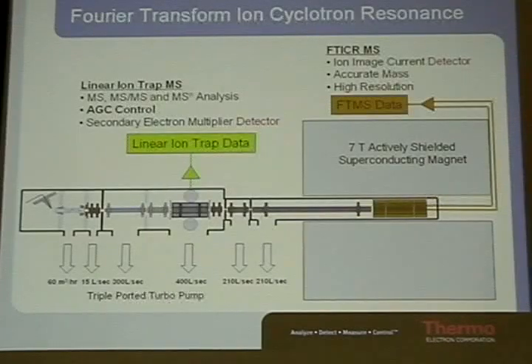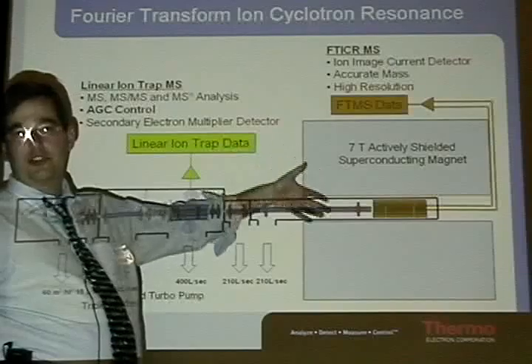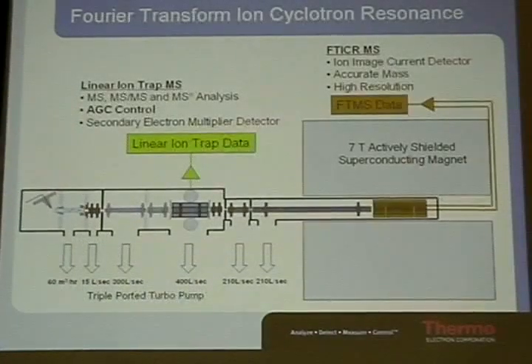Okay. So why don't they just add something in the middle that sort of recongeals it? On the Orbitrap, we developed the C-trap to minimize that, and it resaves them and injects them in properly. We don't know how to do that with the FT because you can't put anything really electronic inside the magnet. So I think this is one of our limitations we're always going to have with the FT, is this change in shape.